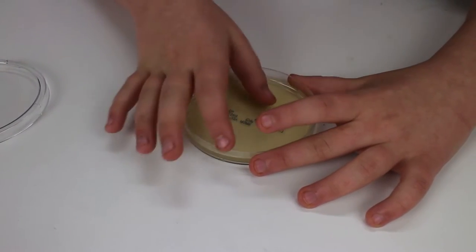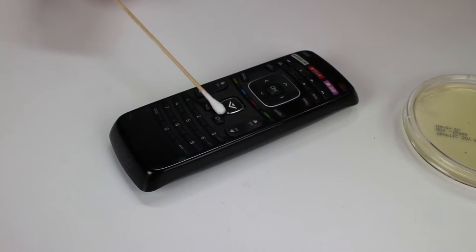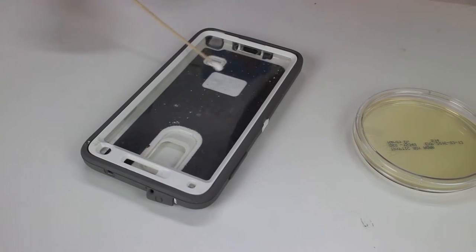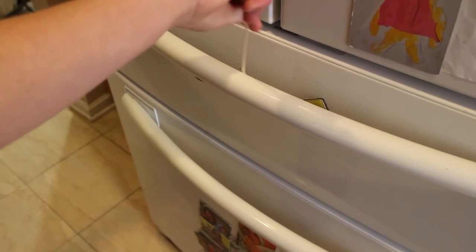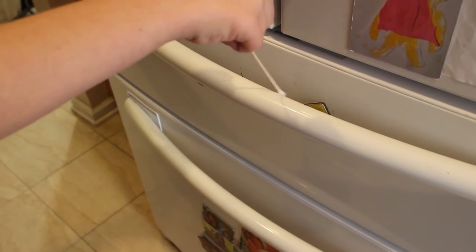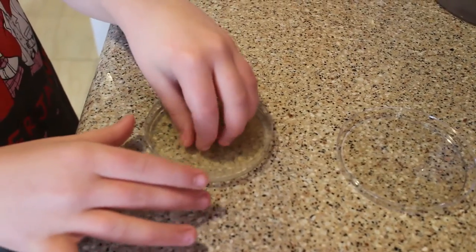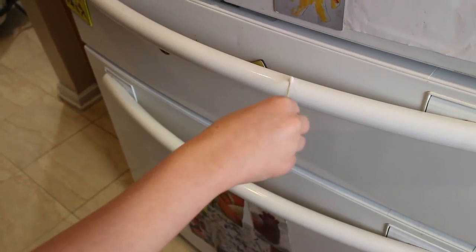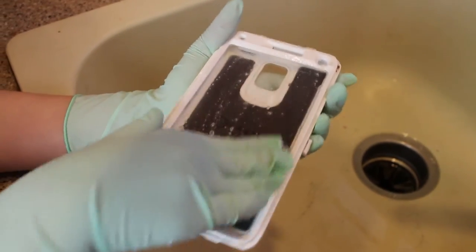First I'm just going to put my fingers directly in the agar to get some bacteria off my hands. Now I'm going to use a Q-tip to take a sample from the remote and put that in a petri dish, then use a new Q-tip to do the same thing with my phone case and put that in a new petri dish. Then I'll use yet another Q-tip to take a sample from the refrigerator door. After that, I'll wash my hands with soap we use almost every day, then take a new sample. We're going to wipe the refrigerator door down with a paper towel and take a new sample. Then we'll wipe the TV remote down with a Lysol disinfectant wipe, and use a little antibacterial soap on my phone case.